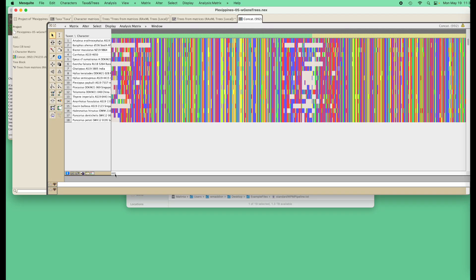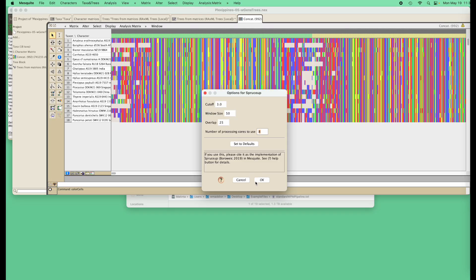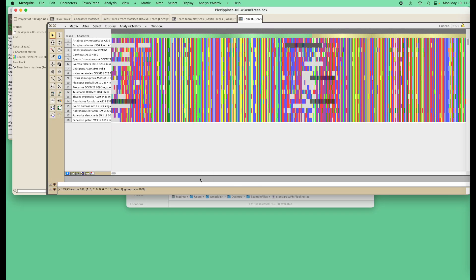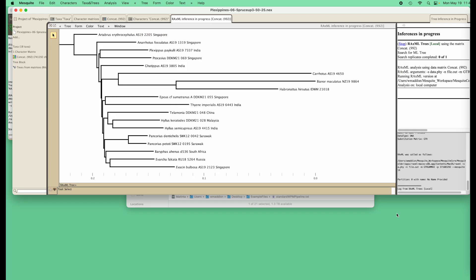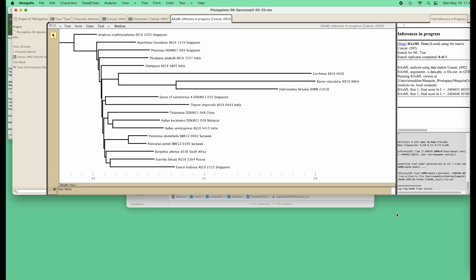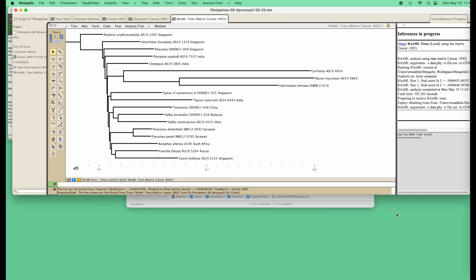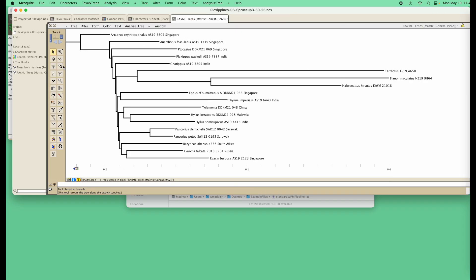We can concatenate and then use SpruceUp to delete rogue subsequences. Programs such as MAFT, MUSCLE, Trimal, IQtree, and RaxML now come bundled with Mesquite.